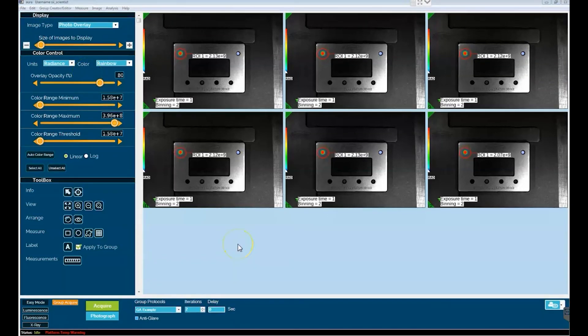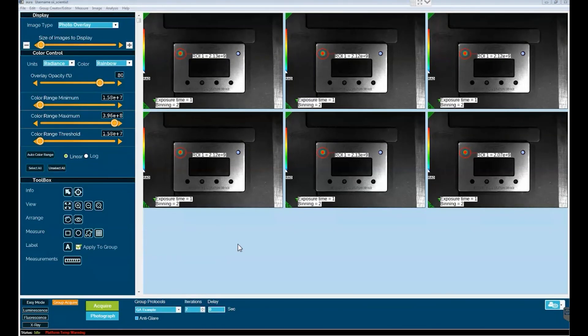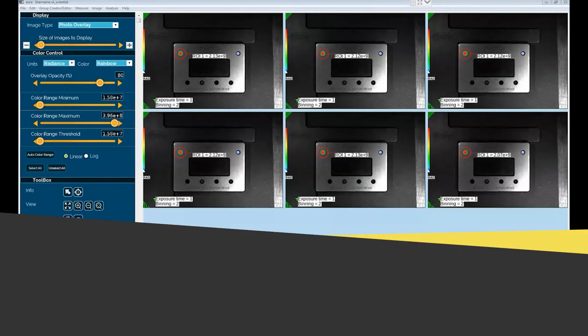So these are some of the special features in Aura for data analysis that are uniquely available to you when you acquire your images through group acquire.